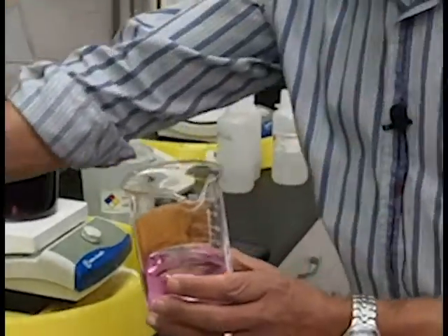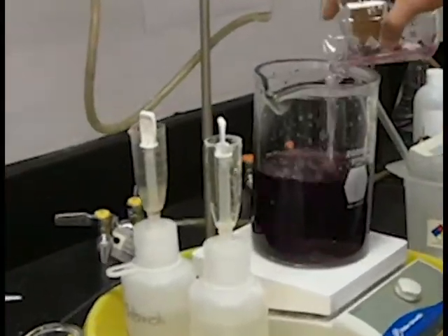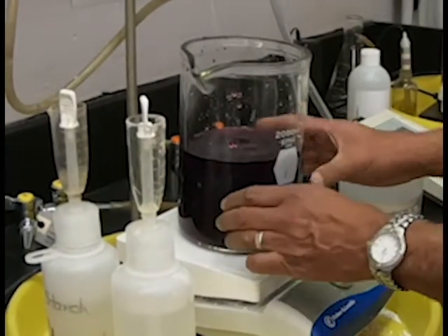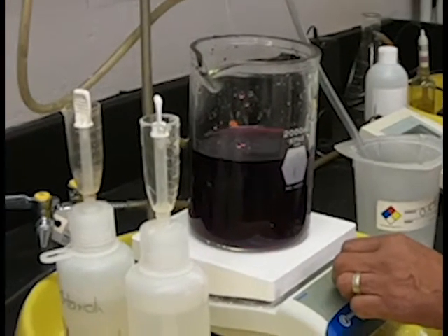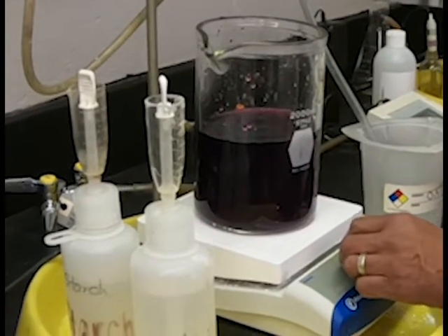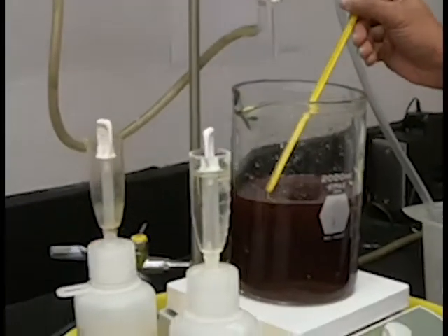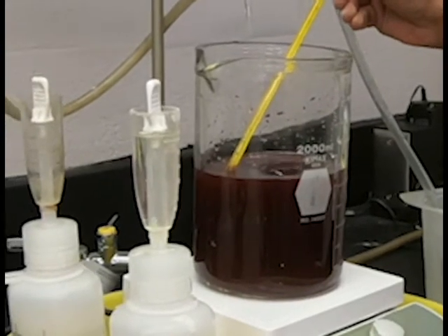Once I have it set, I'm going to start my stopwatch and also add the permanganate solution into the pulp slurry. As you can see, there's a little bit of permanganate left over in the beaker, so I am going to take some of the water I had saved, rinse out the beaker, and add it into the reaction mixer. You can see that the temperature is about 22 degrees centigrade, so you need to write that down on your worksheet.